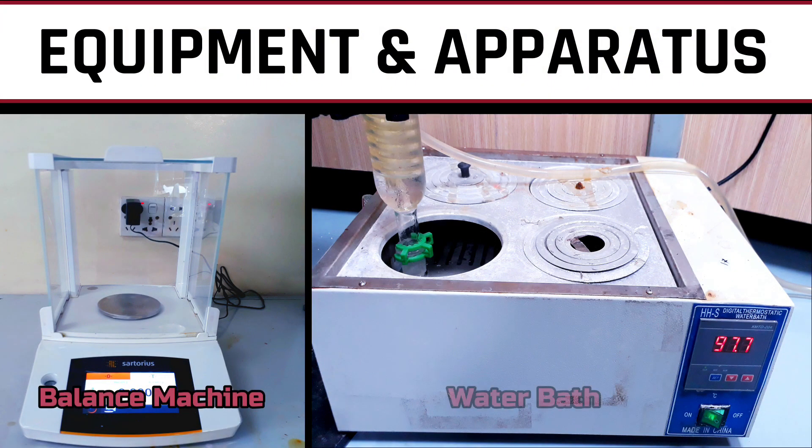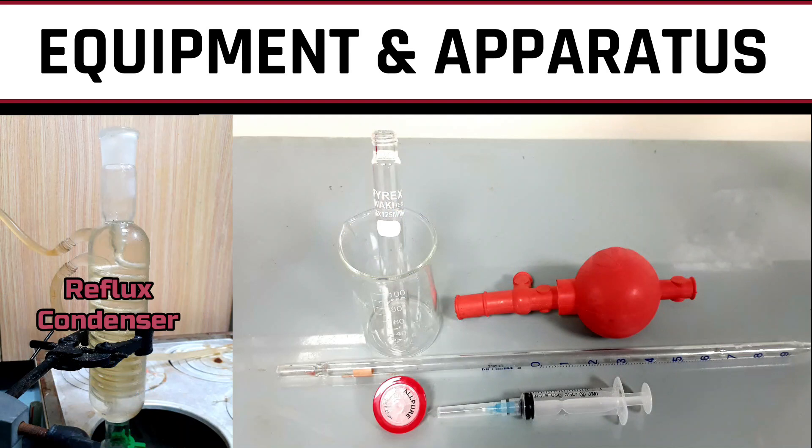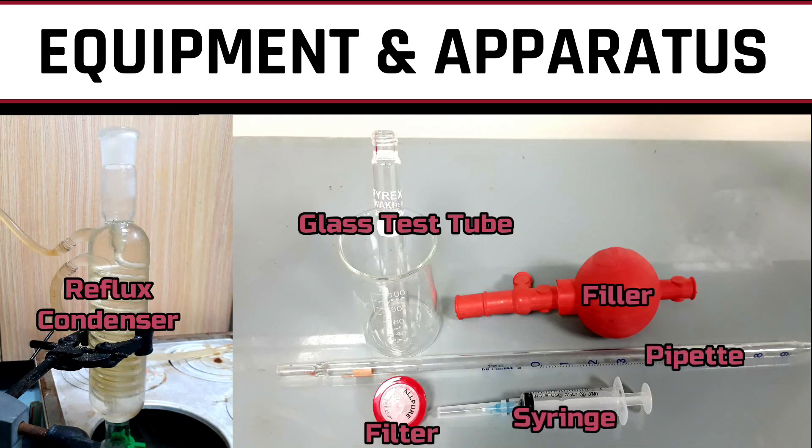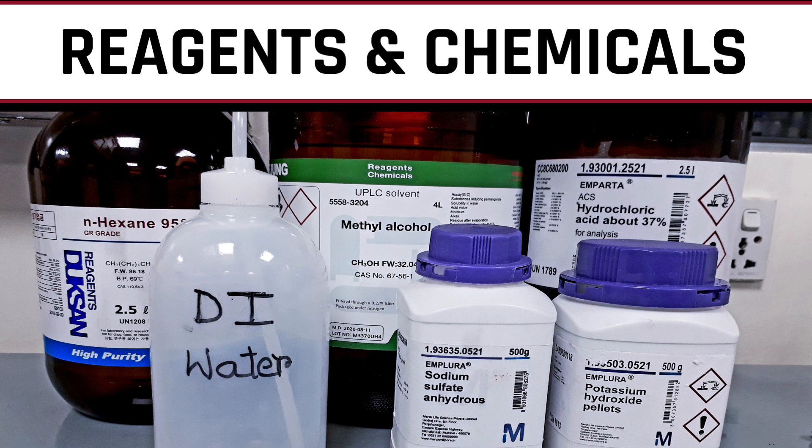Throughout the procedure, we need a balance, water bath, reflux condenser, test tube, pipette with filler, syringe with filter, N-hexane, methanol, hydrochloric acid, deionized water, sodium sulfate anhydrous, and potassium hydroxide pellets.